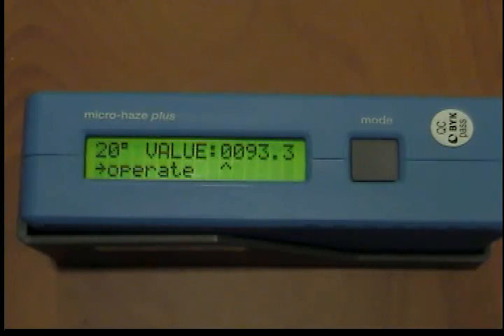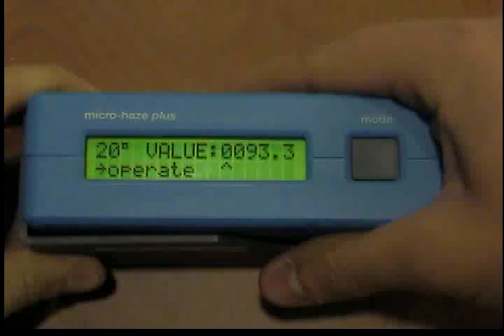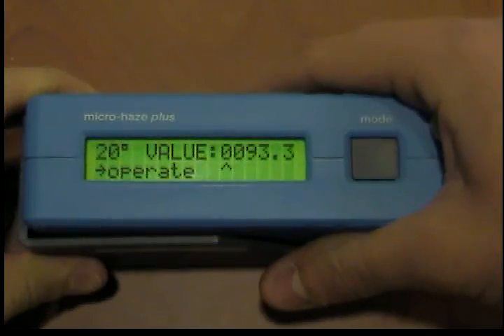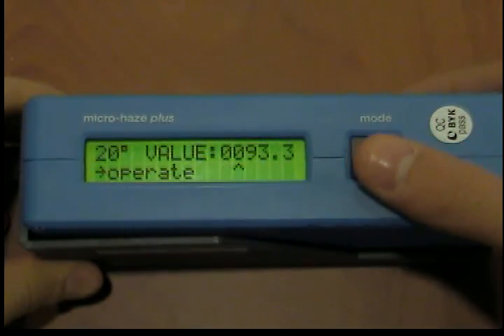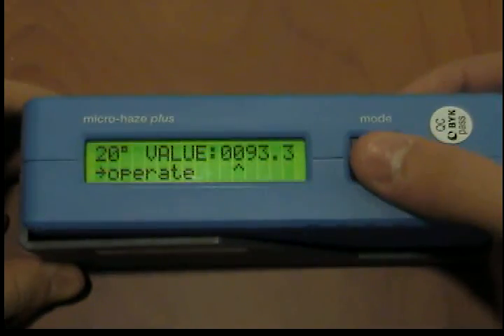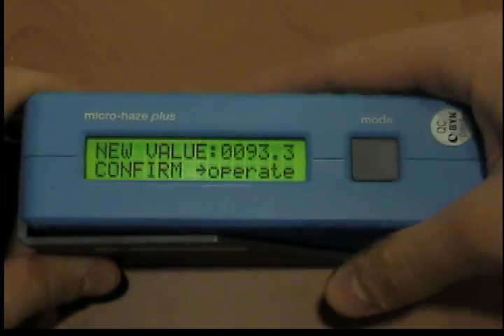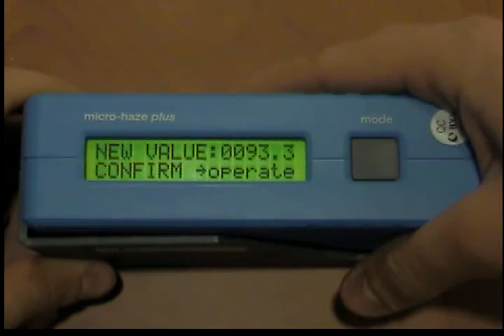Use the operate button to cyclically change the marked digit. Use the mode button to confirm the marked digit — the arrow then goes to the next digit. After having confirmed the last digit, the new value will be displayed. By pressing operate, the value is stored. However, if the value is not correct and not to be stored, actuate mode instead of operate to keep the former value.